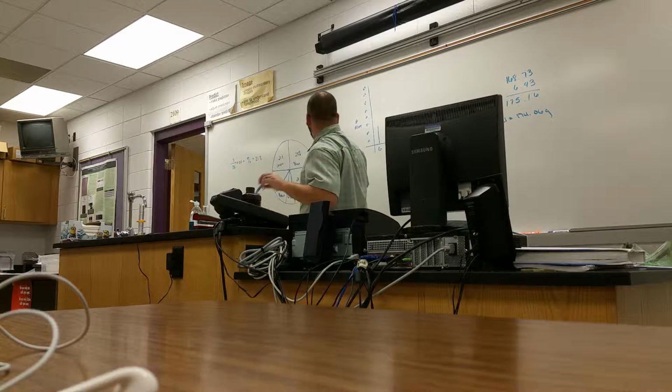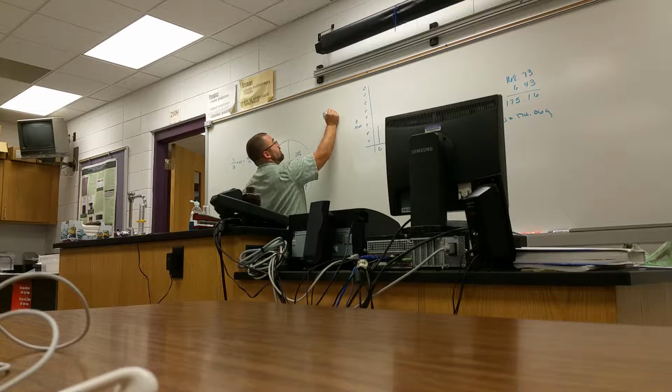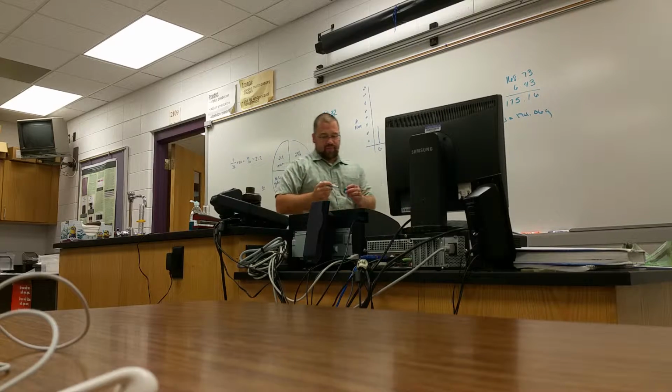167.32. That's the flask and the water. Now, there are some other things that we need to add to this.